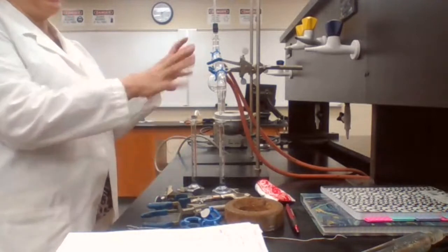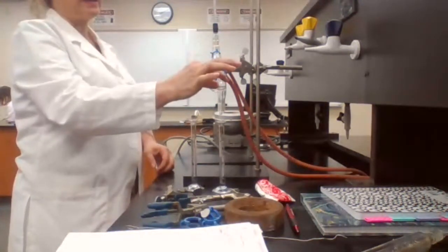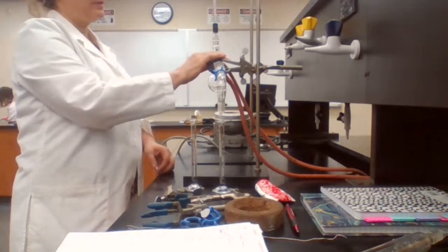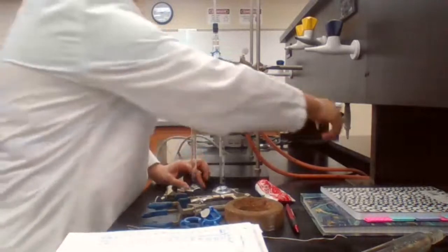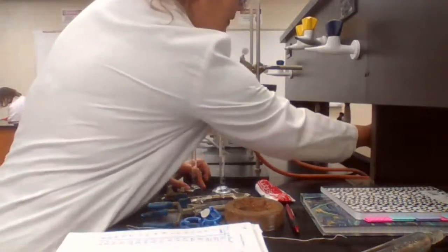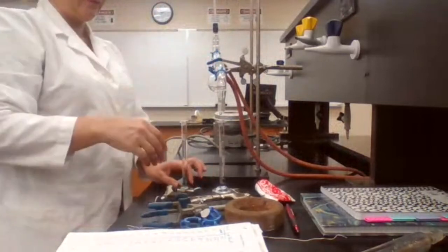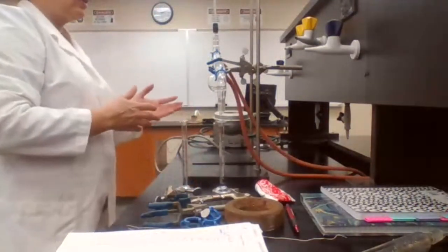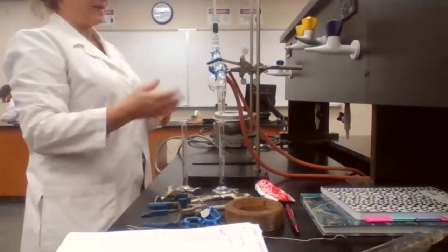If I was going to disassemble this, take it apart, I would go from the cold side. So I would take this piece out first, then the condenser. And in order to take the condenser out, I should close the water first and separate the hose from the faucet and allow the water to drain. I am going to use this condenser for the fractional distillation. So I'm saving that for the fractional distillation, but I'll show you when I'm disassembling the fractional distillation.